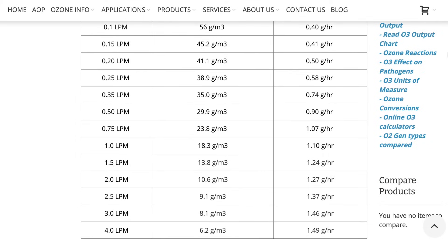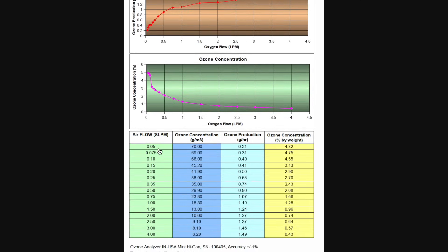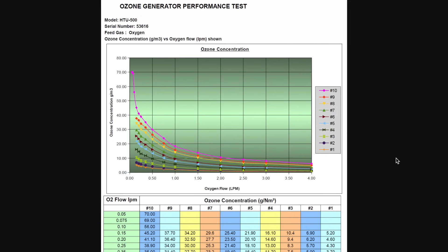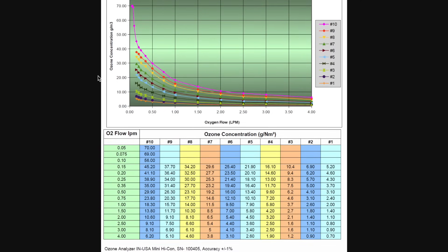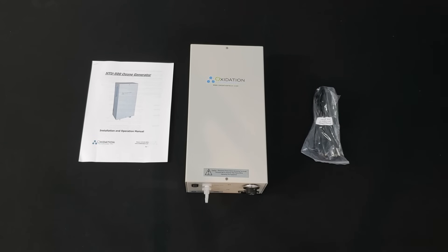We have tested this unit for ozone production at every position of the switch and flow rates. These charts, available on our website, illustrate the ozone production at various flow rates. The HTU 500 is capable of producing very consistent levels of ozone over a long period of time. It is a turnkey ozone generator that produces consistent ozone levels from either dry air or oxygen feed gas, and its high-quality components and ease of use make it a favorite for laboratories and small industrial applications.